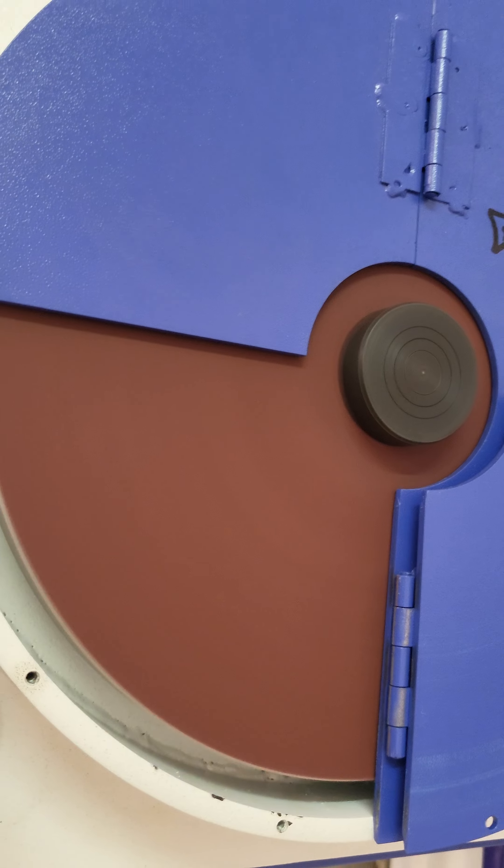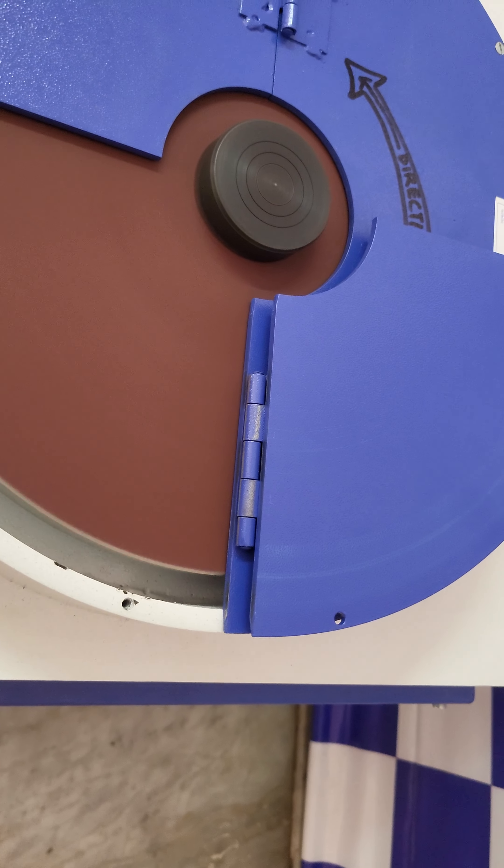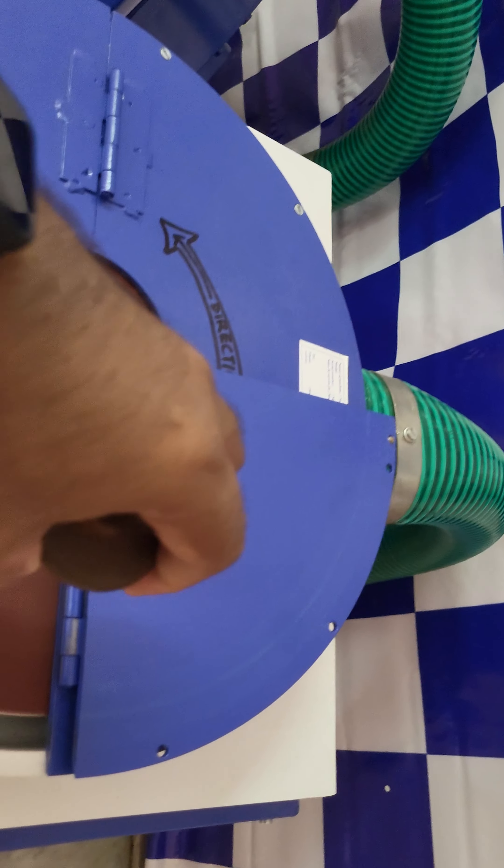Let me show it to you. Here is the machine operating — you can take a sample and polish it like this.